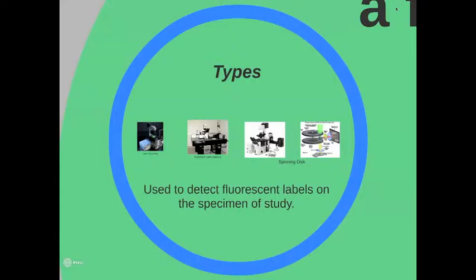A photomultiplier tube, or PMT, detects the points of light through a pinhole. Because different parts of a specimen are labeled with different fluorescent probes, certain parts will light up when viewed with a confocal microscope, and the signal is interpreted in the PMT.